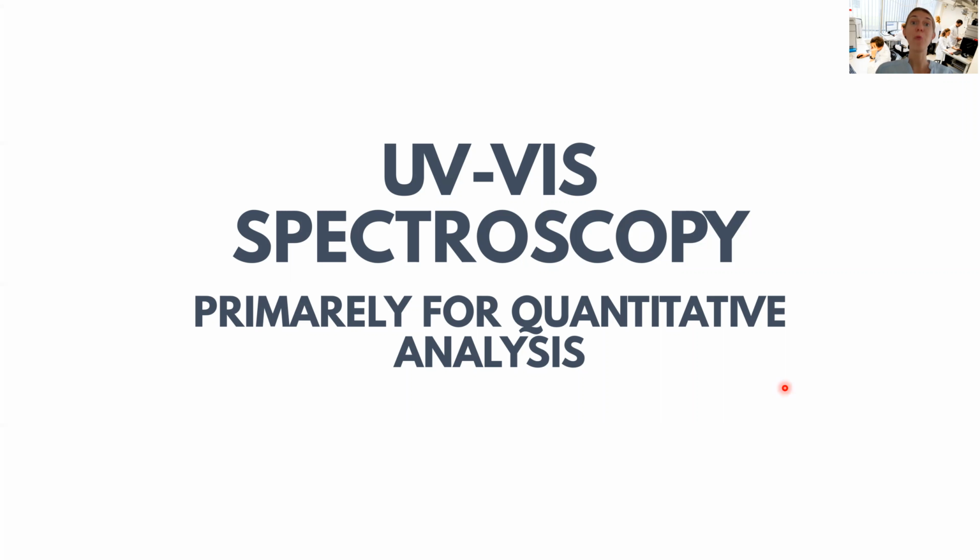Hello, welcome to the next lecture about spectroscopy. And in these two upcoming lectures, we are going to dig into the ultraviolet spectroscopy for molecules. So we are dealing with absorption spectroscopy here. And in the first part, we are going to look at what the instrumentation for obtaining this kind of spectra looks like. And in the second video, we are going to look at the spectra itself and how to perform quantitative analysis.